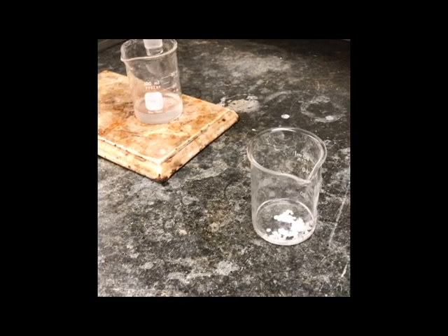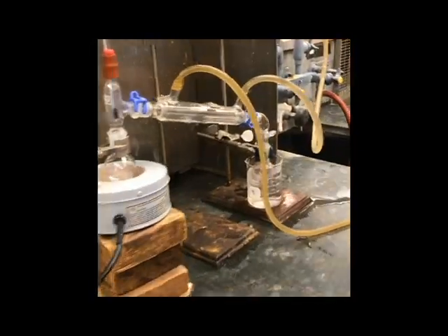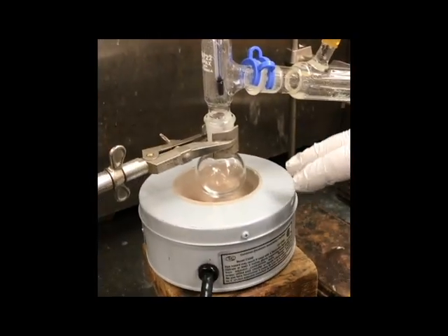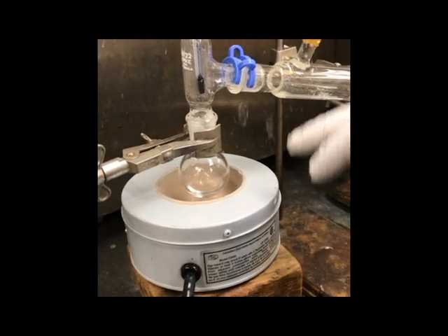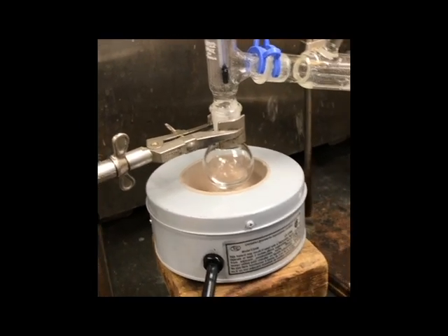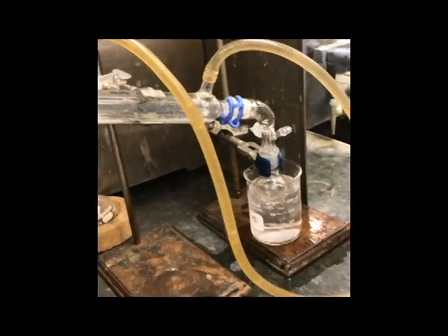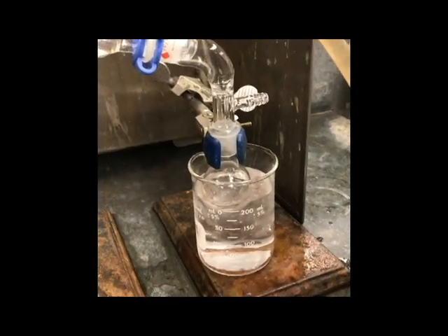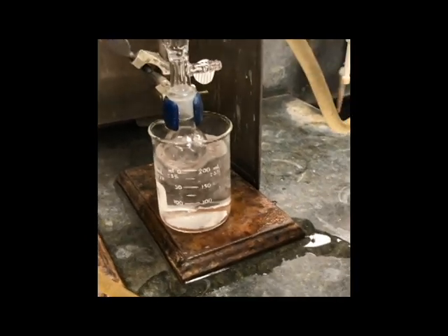So now we have dried our crude reaction mixture over some anhydrous calcium chloride. We have transferred it over to this 25 milliliter flask. This one is not pre-weighed. We're just getting ready to start heating it up. Before we heat it up, of course, we'll add in some boiling chips. We want to keep our temperature somewhere between 80 and 85 degrees. Our fractions will be collected into this pre-weighed flask over here. This is going to be cooled on an ice bath, once again, to limit evaporation of our product. And we will come back to you guys when we have collected everything.